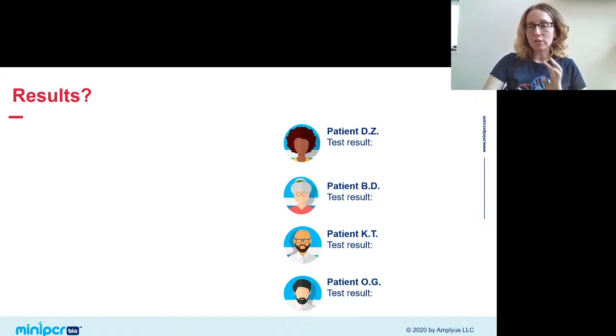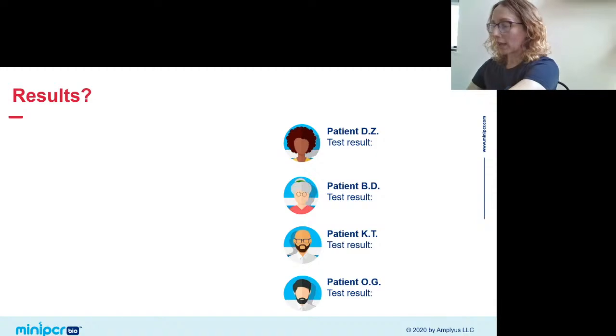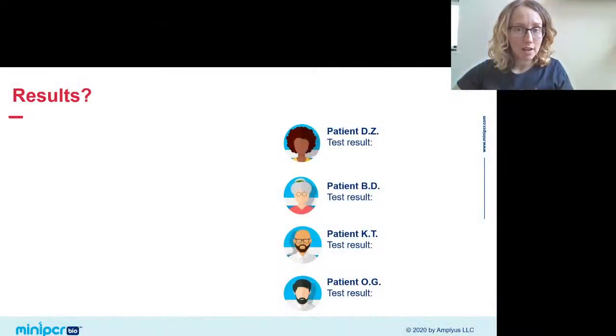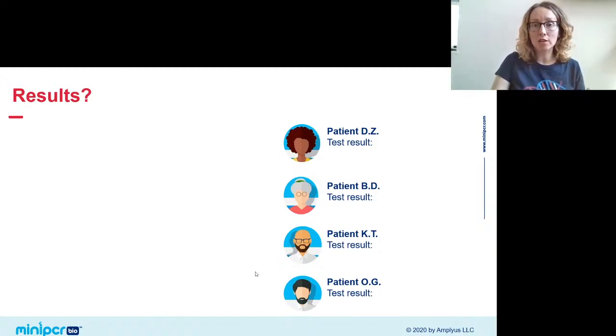So now I think we're ready. Let's look at our results and let's look at them in real time first. I have a picture here we can look at, but so you can see our real time results. I'm going to take this imaging hood and put it over my blue gel. This is just going to block out ambient light and then getting my webcam ready. Oh, good. Okay, great. Our results look nice. I'm going to switch now to my webcam so you can see as well. And so sure enough, now our gel has been running for maybe 15 minutes, but we see bands in the five lanes that we loaded. We see ladder in the leftmost lane and then we see some patient bands as well. Now, if you have a really good memory, you know what those mean already, but let's actually switch back to my slides. I ran this earlier and we can look at the photo I took of my gel earlier, which looks just like this gel. And I can remind you of what each band means.